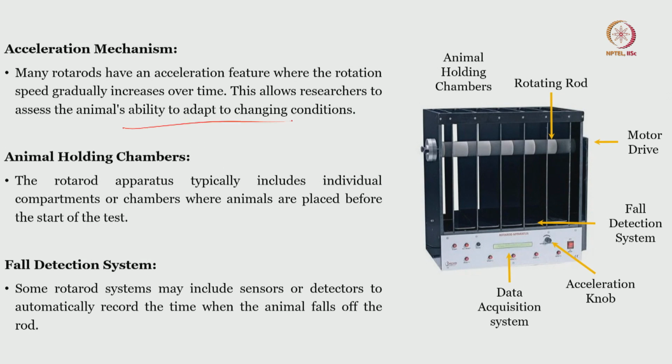So it all says that before you induce Parkinsonism, you need to get the entire spectrum of the rodent behavior by changing the diameter, changing the surface, and changing the acceleration. So this particular apparatus is pretty flexible to accommodate all those manifestations that can happen, depending on the spectrum of clinical features that can come up with your cytotoxic agent injection, alright.